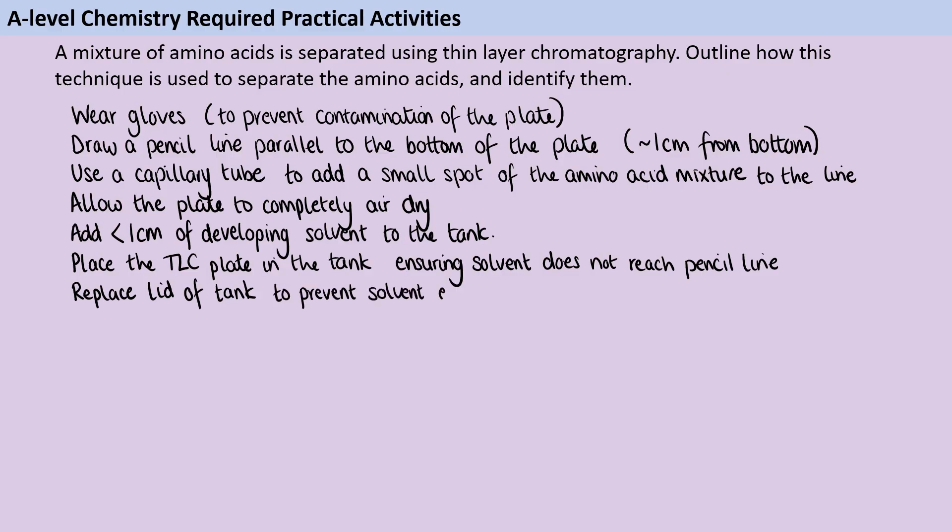When the solvent is getting close to the top of the tank then we're going to remove that plate. We don't want to let it run all the way to the top because we need to know exactly where that solvent front was. Obviously if it runs all the way to the top and then potentially slightly over we can't give a numerical value to how far the solvent went. So we need to stop before it gets all the way to the top.